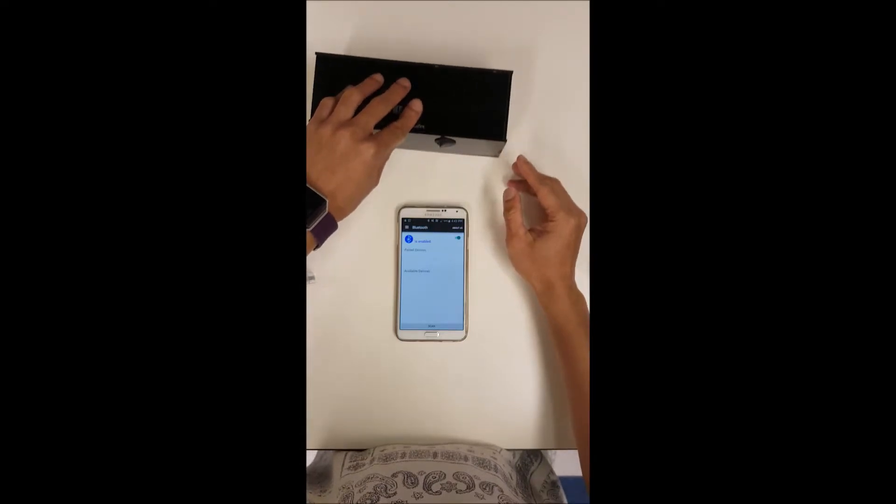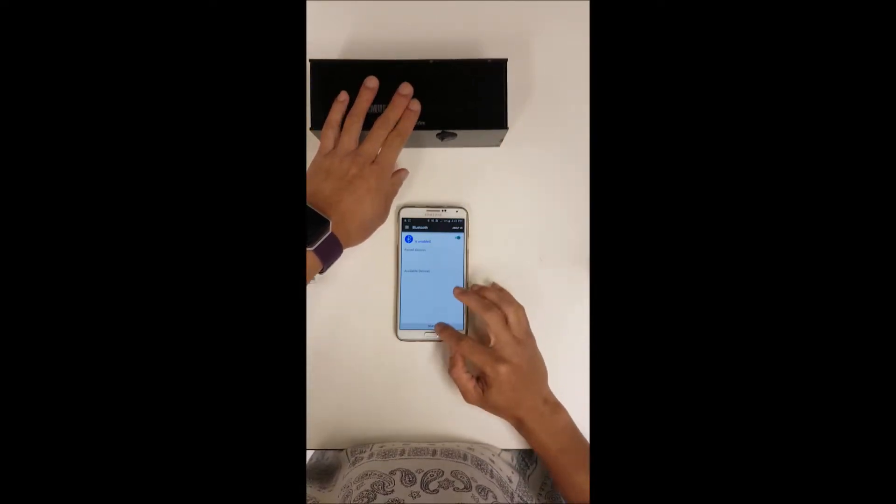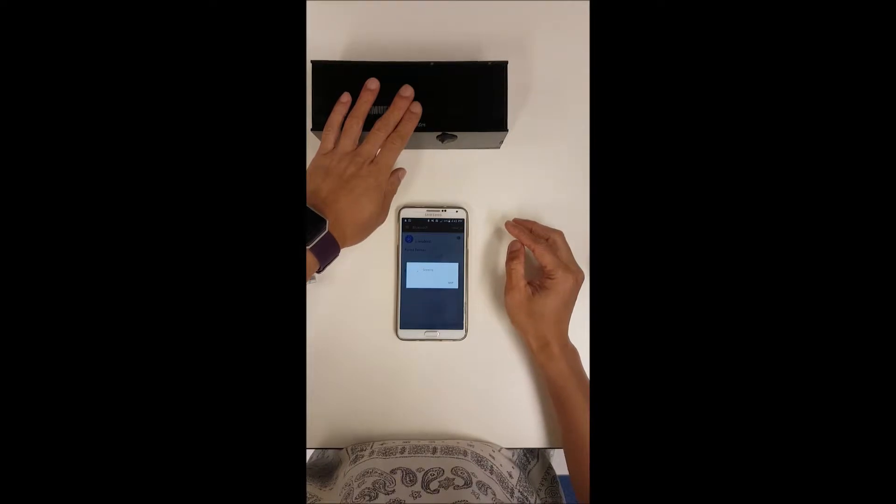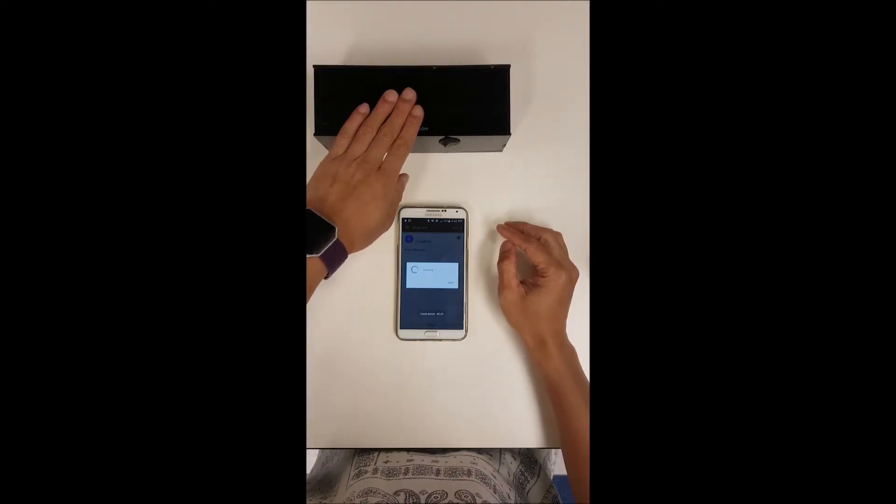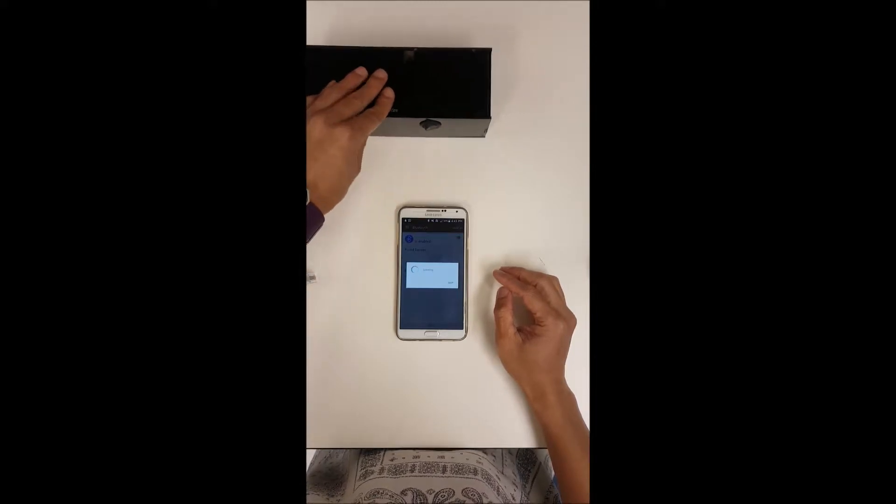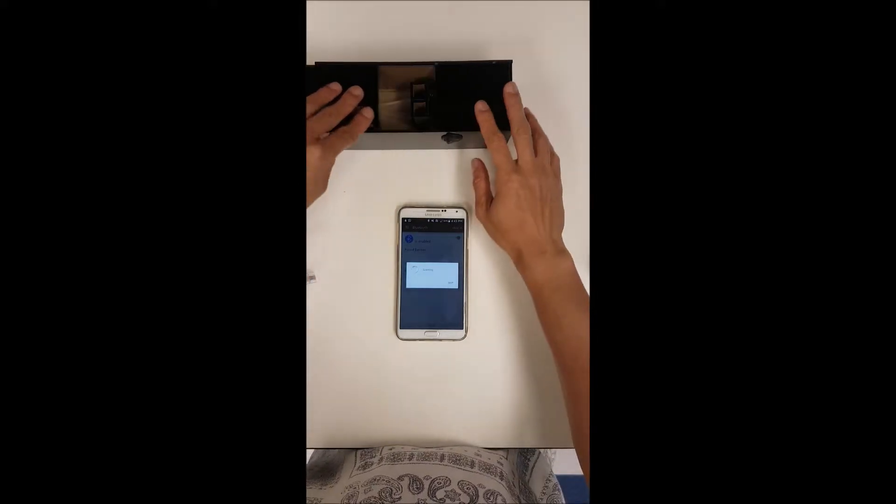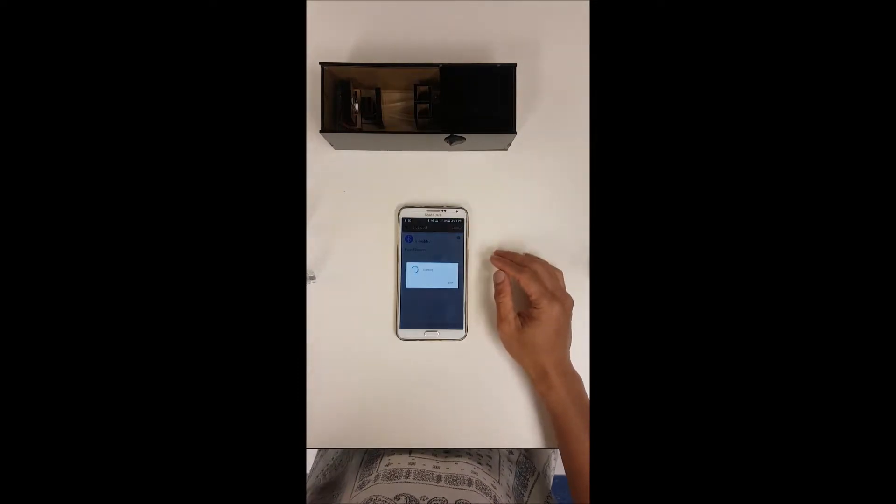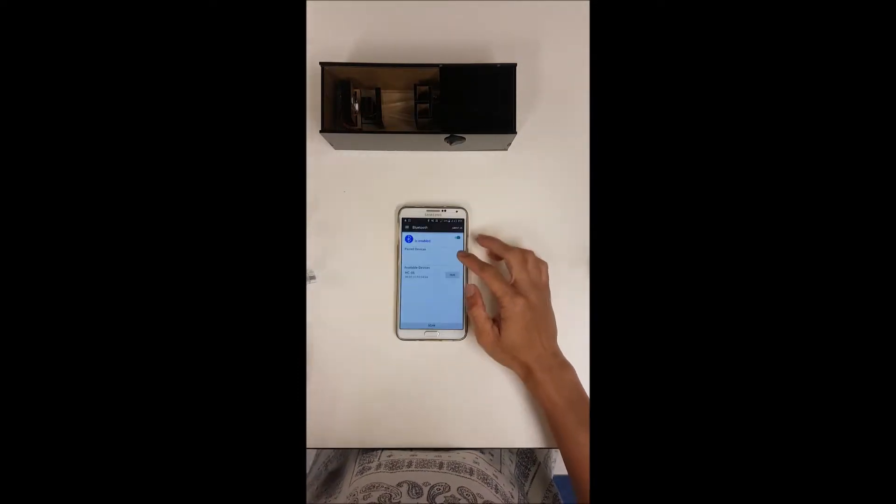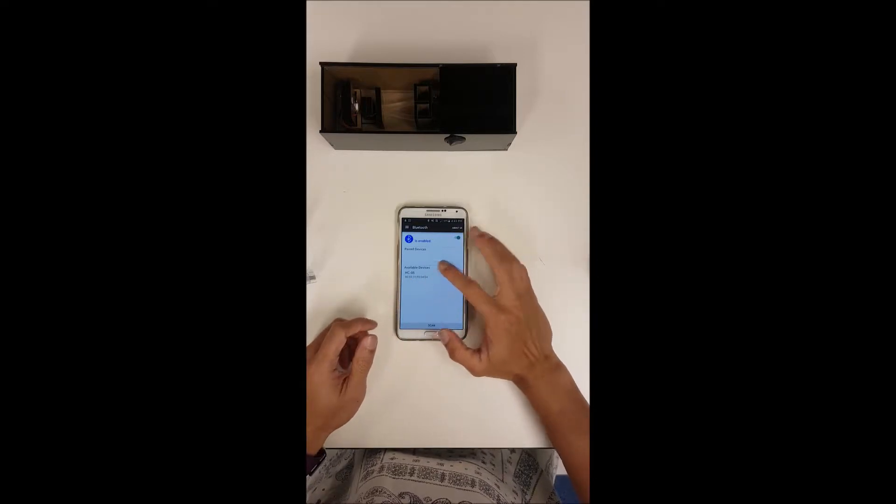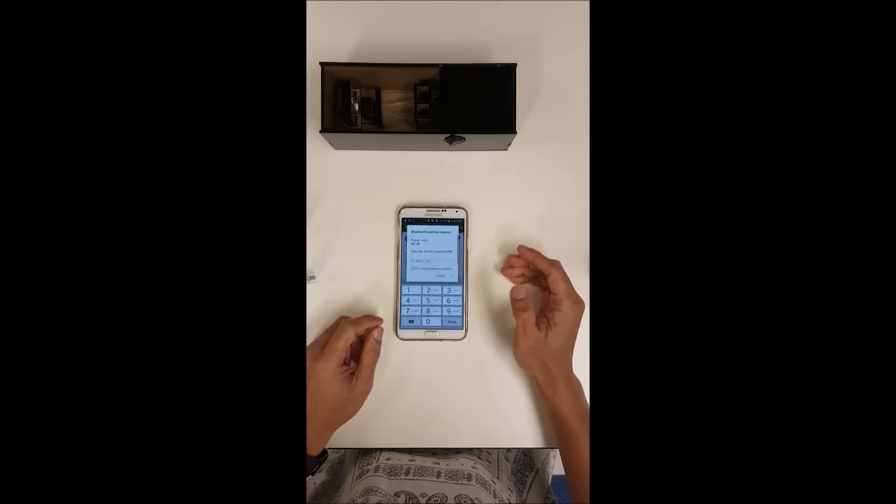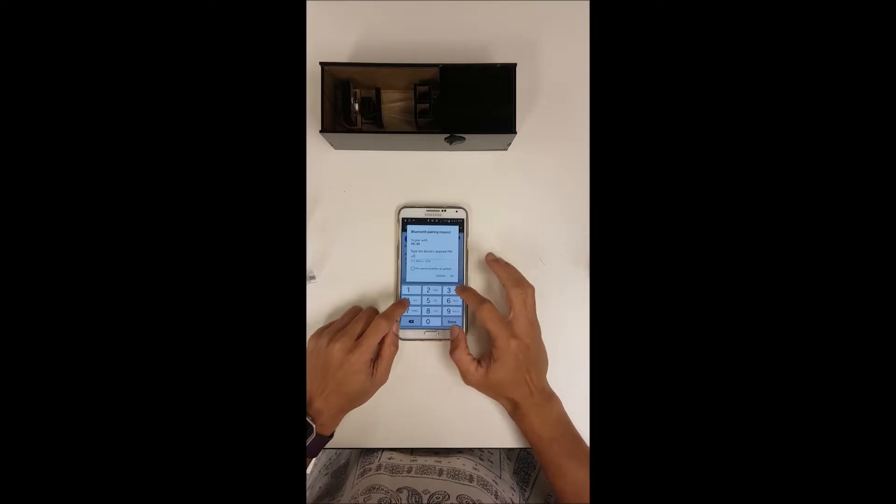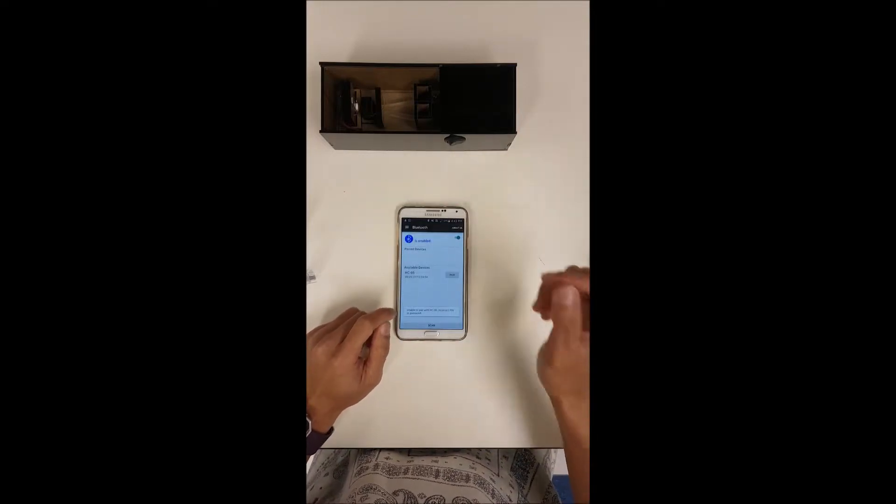Once you have enabled the Bluetooth you can scan for it. It might take a while depending on the device that you have. Based on this you can connect to it. Our code for the connection is HC05. You pair up with it and you have the code for this particular device.